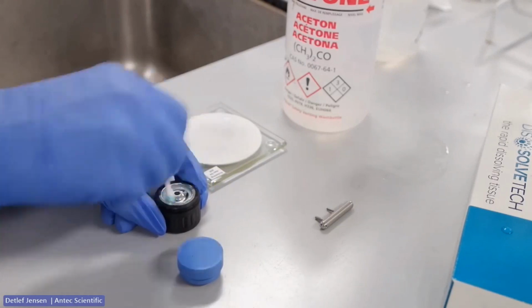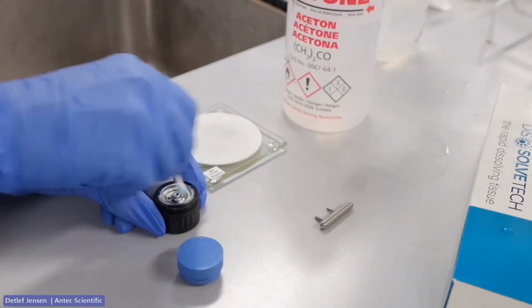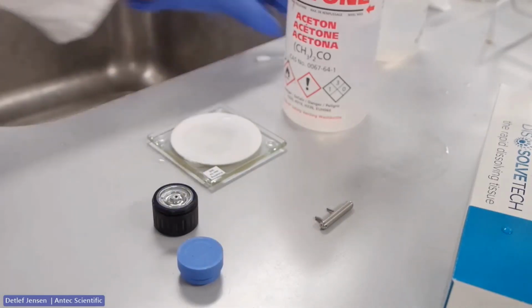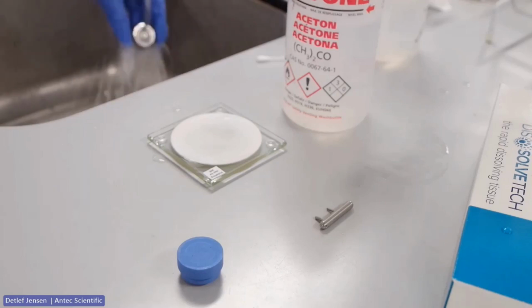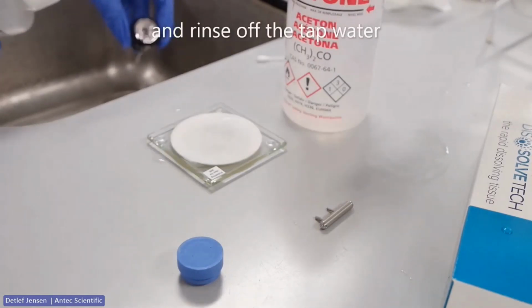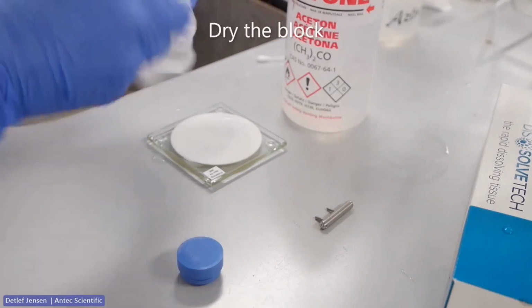Polish the auxiliary electrode. Rinse off the diamond slurry. First with tap water. Then with deionized water. Dry the block.